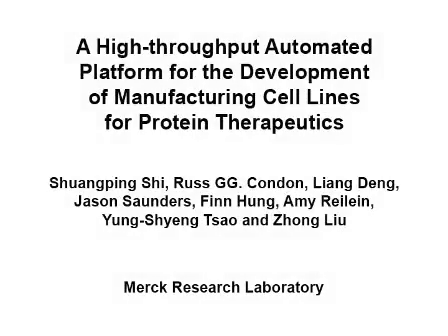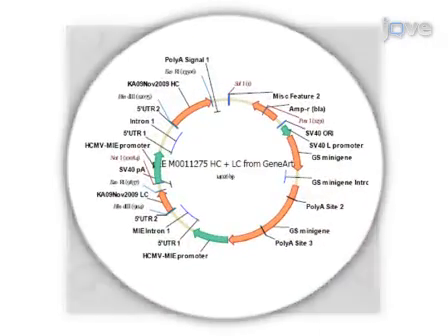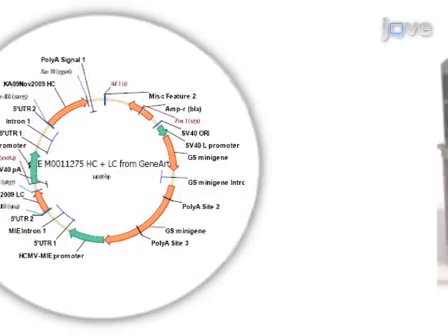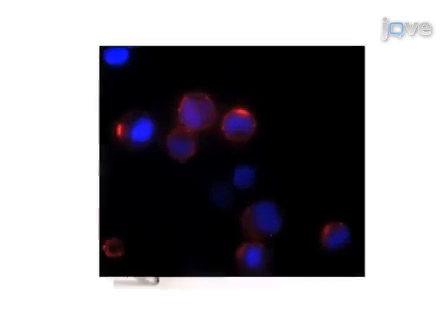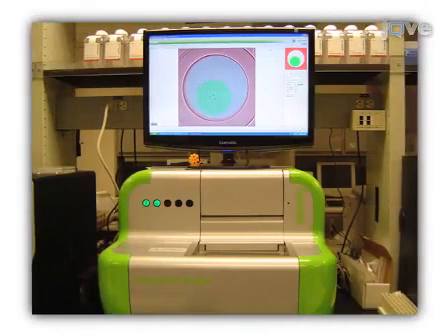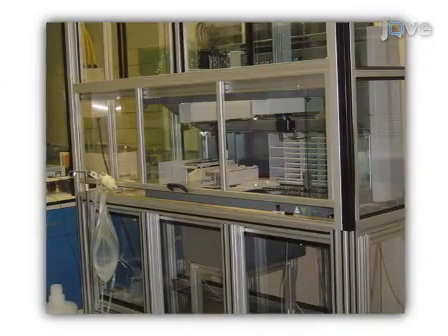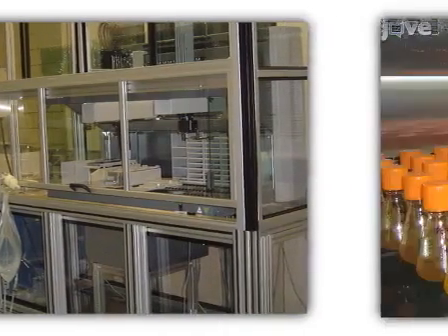The overall goal of this procedure is to develop manufacturing cell lines for biologics with clonality and high productivity. This is accomplished by first transfecting the host cell with DNA encoding the gene of interest. The next step of the procedure is to isolate high-producing clones by FACS, followed by documentation of colony formation by the CloneSelect imager. The final step is to screen and select highly productive clones.